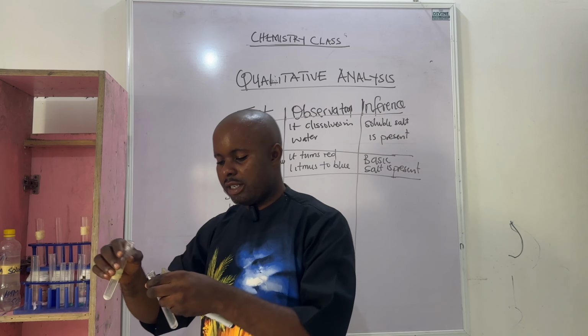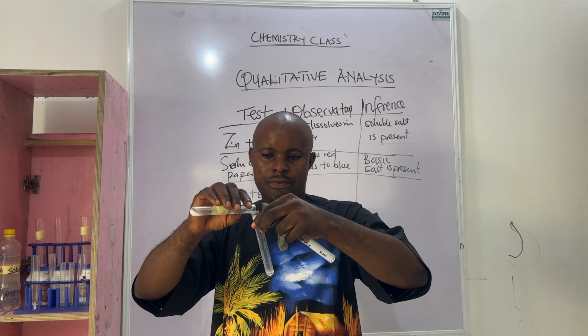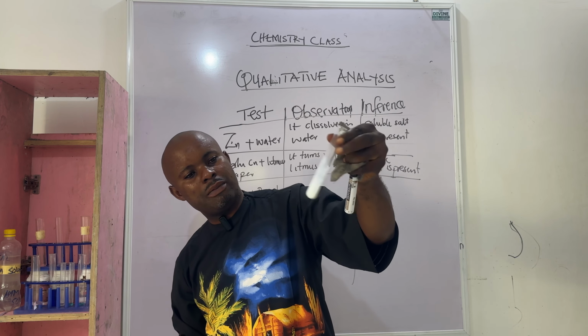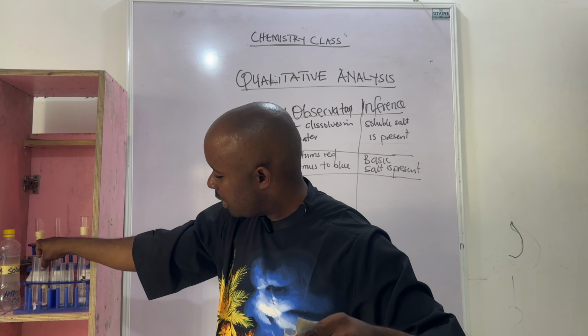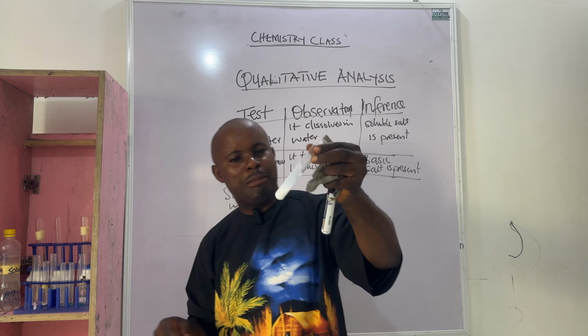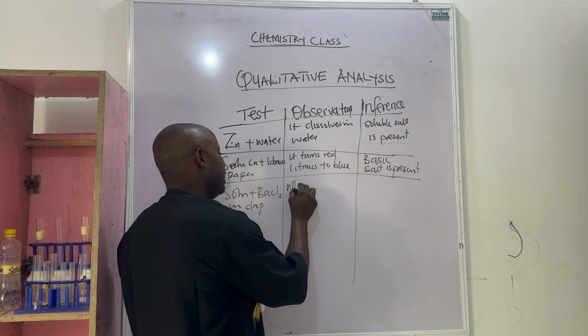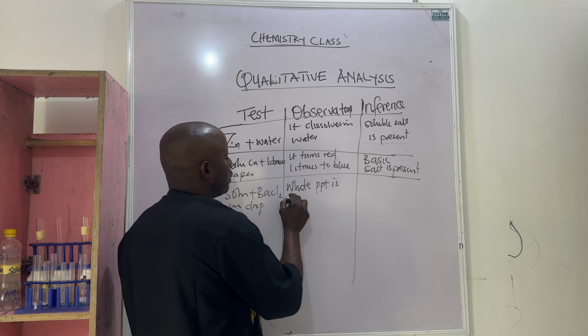I will add it in drops. You can see that when I add it in drops or in excess, it gives a specific characteristic: a white PPT is observed.